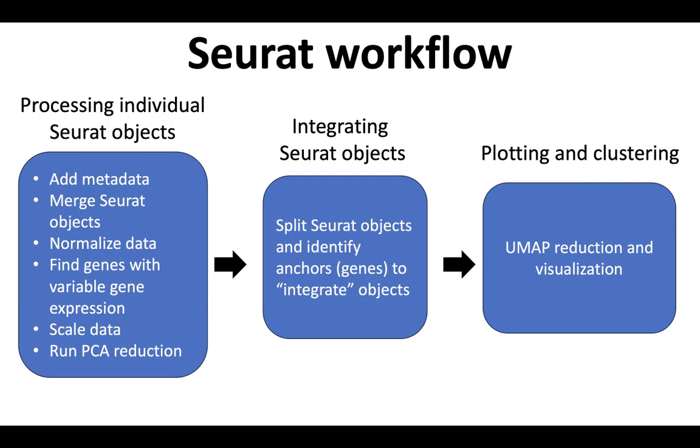And then finally in Seurat, we're able to plot and cluster our single cell sequencing using UMAP, which, as Chris said, is the predominant form of visualization and dimensional reduction used for single cell sequencing these days.